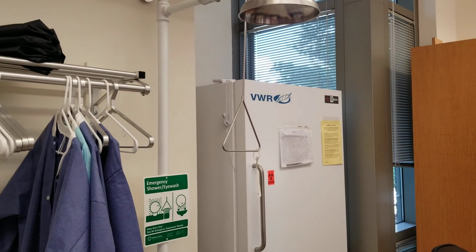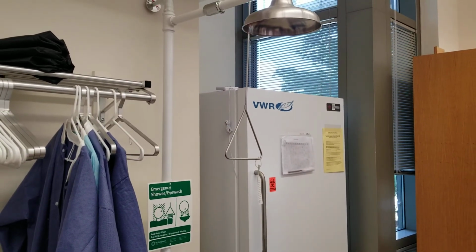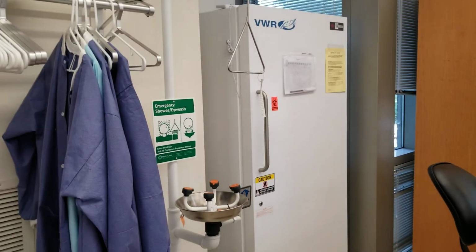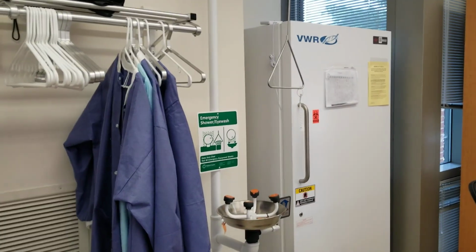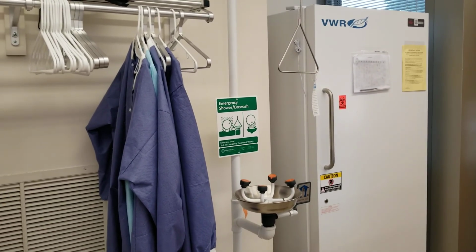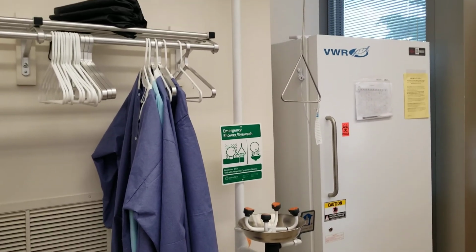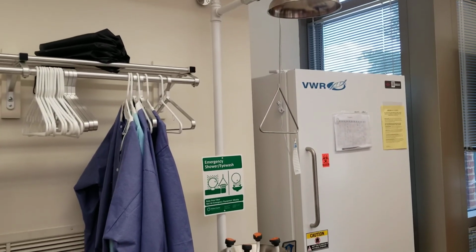Please do not do this in class unless it is absolutely necessary, because it will go out all over the floor and we don't have a drain. So it'll just flood the entire floor and go outside. If it's a chemical, it will be diluted and we will have a response team clean it up.